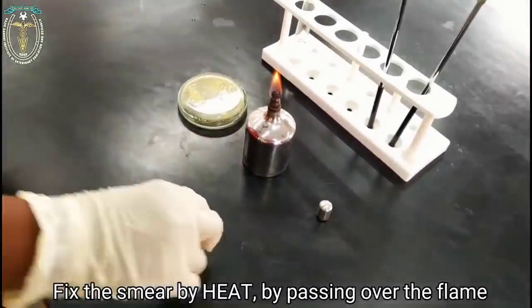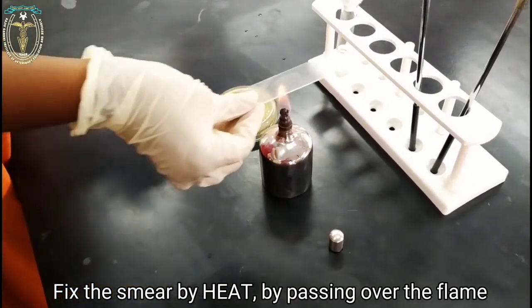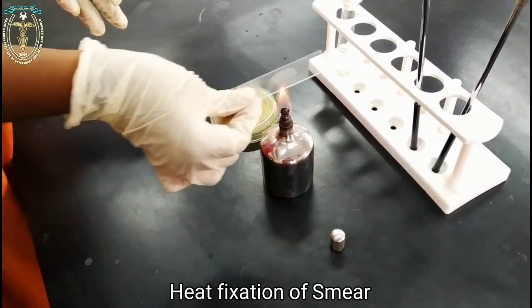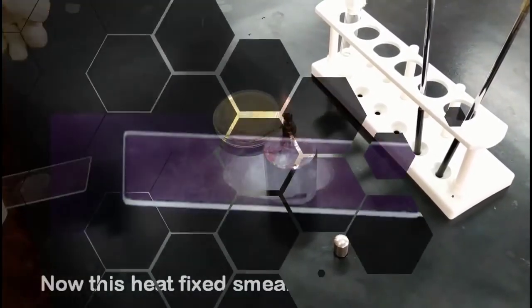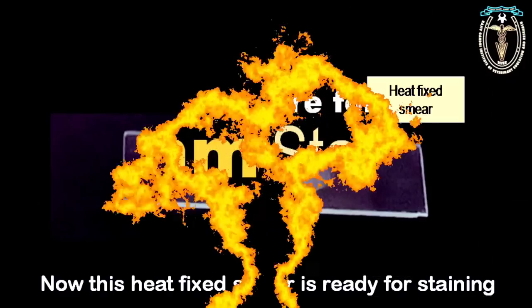After air drying, fix the smear by heat by passing it over the flame 2 to 3 times with a slow sweeping motion. This is called heat fixation of the smear. Now, this heat-fixed smear is ready for the staining.